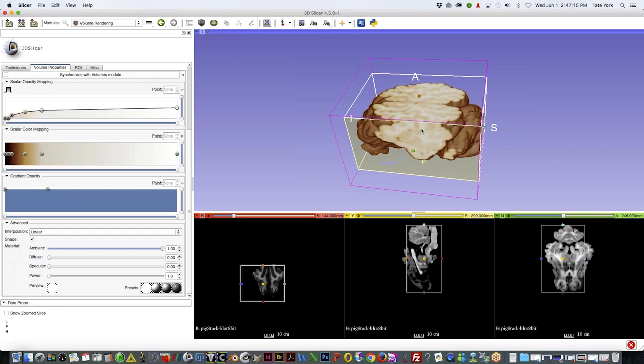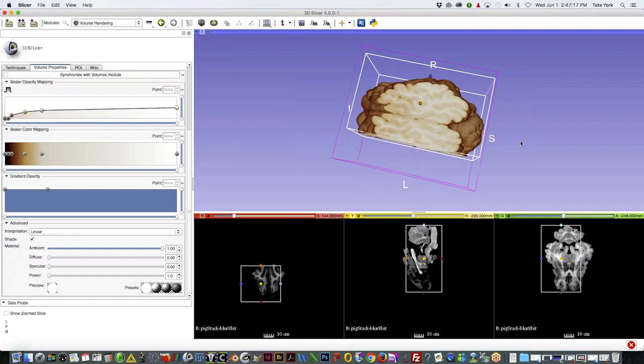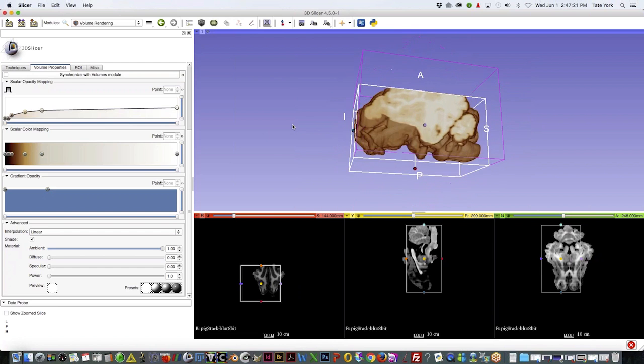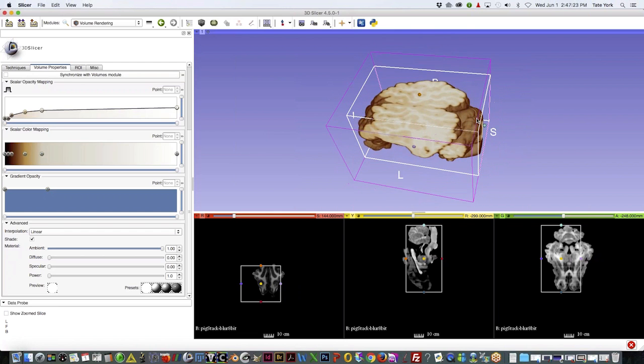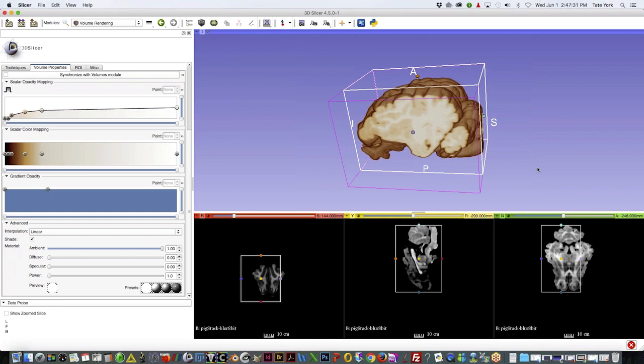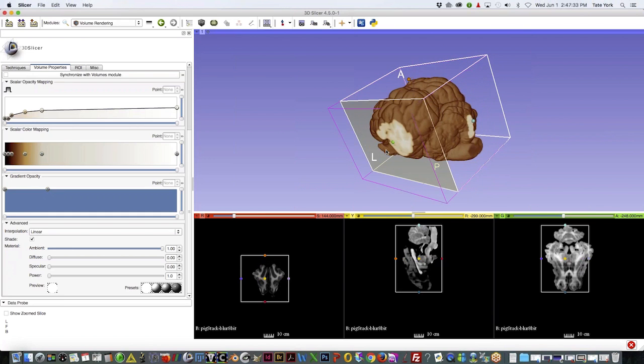And this is completely interactive. I encourage you to go to our website, play around with it, explore it. So with the surface map, you're not getting the information on the inside. As you can see, it's a shell of the tissue.